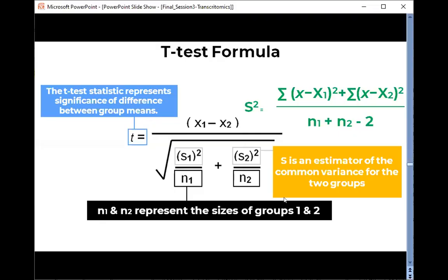So what is the limitation of the t-test? It can be applied only when we have normalized data. Aditya has a question: what log filter can be utilized? It is plus 1, plus and minus 1 both. So that's the minimum. If you want to use a maximum filter, if you still have a very large number of genes and you want to filter out only a few genes, you can choose higher log fold changes.